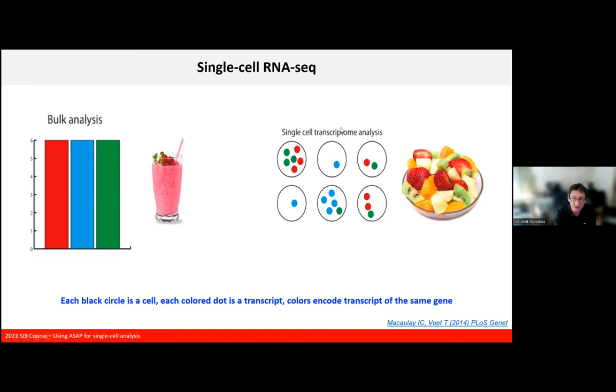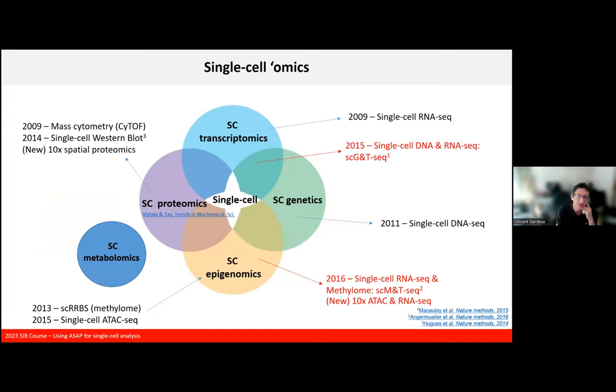Conversely, if you use single-cell data, you really can get the transcriptome information at the single-cell level. For every cell, you get RNA information. And this is for transcriptomics, but the single-cell field is big. You can also do proteomics at the single-cell level, whole genome sequencing, whole exome sequencing, and epigenomics data. You can even get ATAC-seq and RNA-seq data from the same cell, which is called multiomics. And more recently, we also have spatial transcriptomics, which I still put in single cell, but it's not really single cell because you get a spot, and in a spot you can actually have multiple cells. But it's still growing a lot, and people usually use it together with single-cell methodology, like UMAP and so on. So it's still something that is very big today.